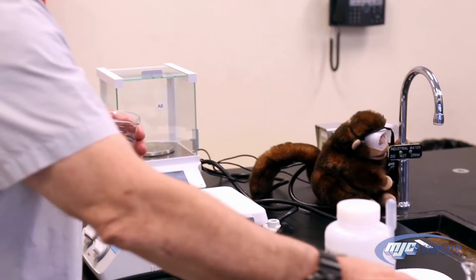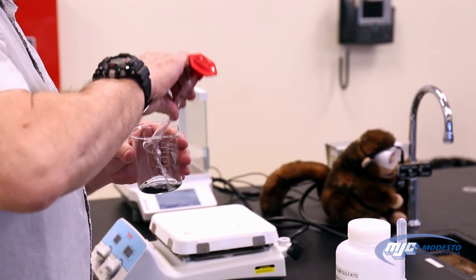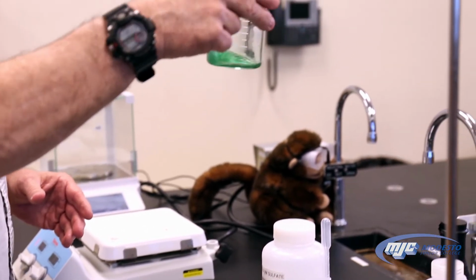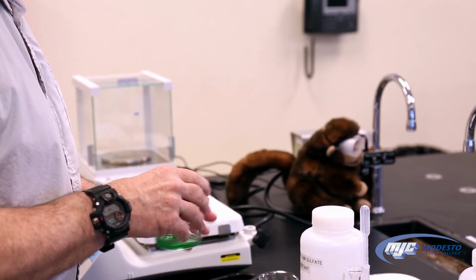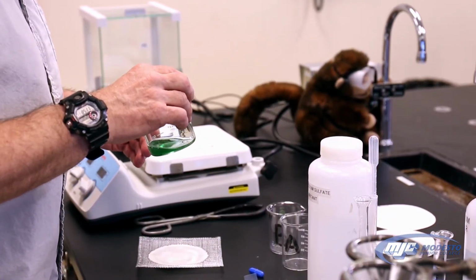And then we're going to take about 10 mils of DI water. It doesn't have to be exact. Pour it in. And that's just the water. You can see it's starting to turn blue, kind of greenish blue. That's the copper 2 ion. And then we're going to add some sodium hydroxide. I want to make sure it's all dissolved first.